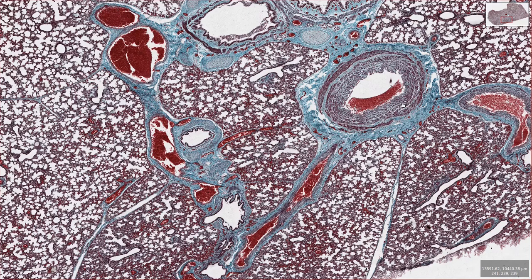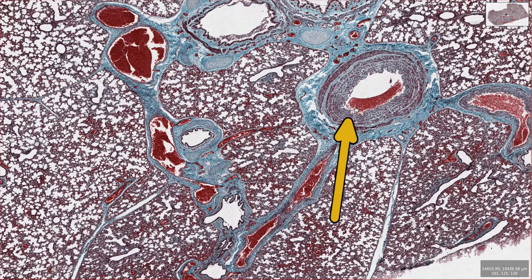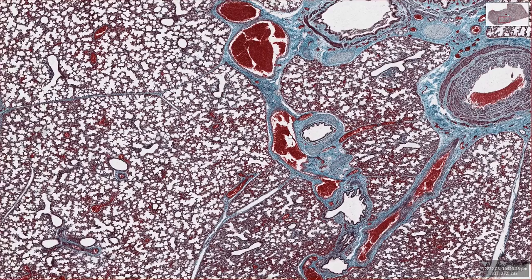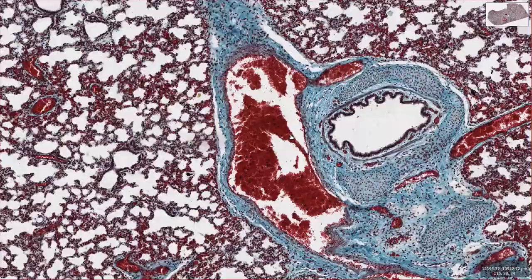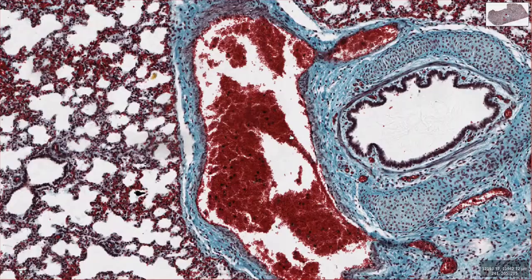This is a section of lung from a calf, and in the lung there are lots of tubular structures that you might confuse with blood vessels. If you look at this section here we can clearly see an artery and lots of veins. We can tell that they're arteries and veins because of their structure and mainly because they've got lots of red blood cells in them.